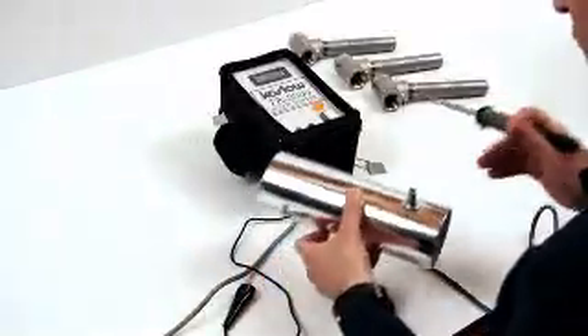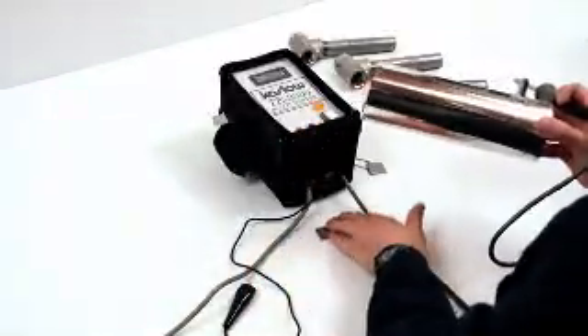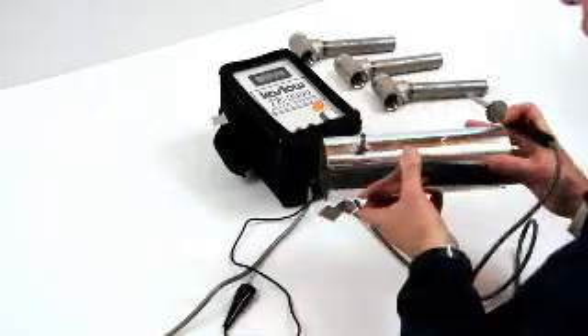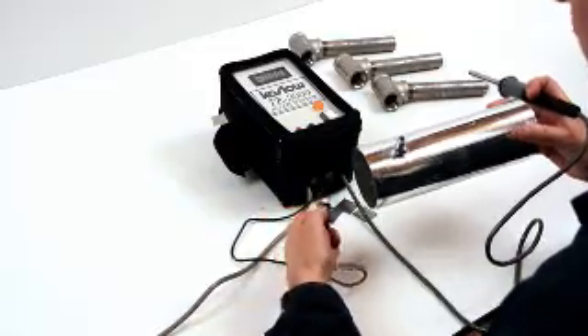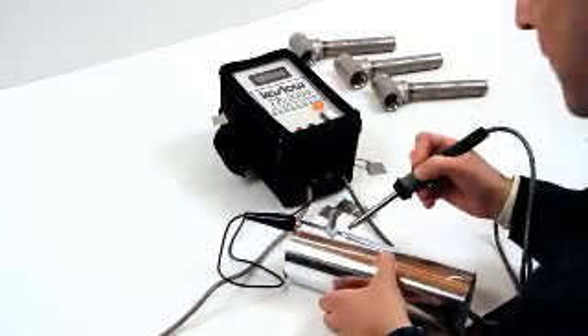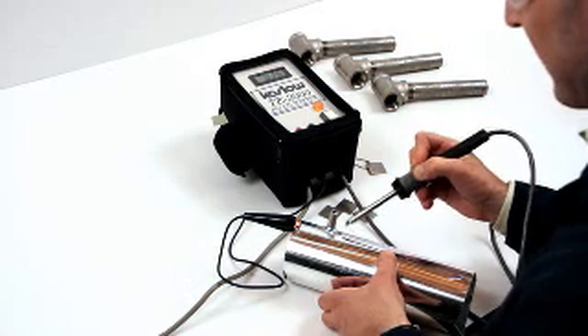The TE3000 is also very effective at identifying welds, and can verify that a weld is made of the same material as the base metal. Simply clip on with the alligator clip, make contact with the metal, and make contact with the weld.